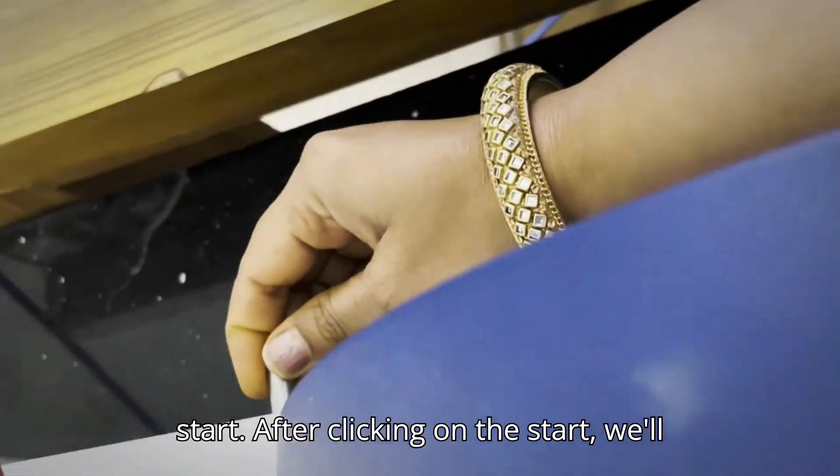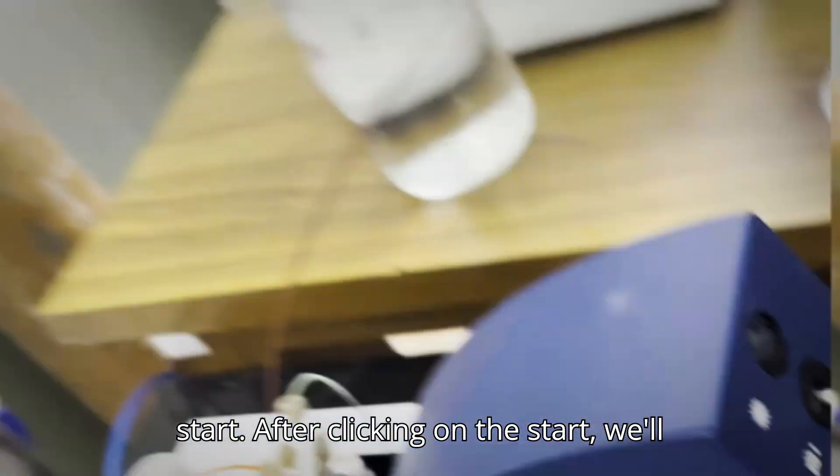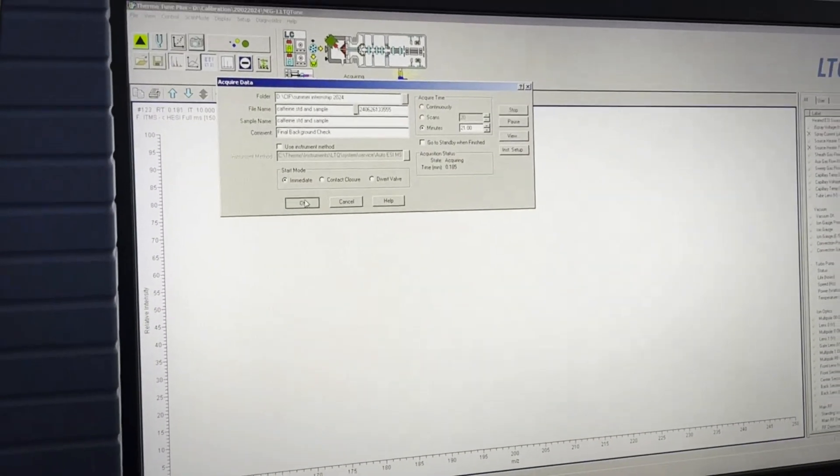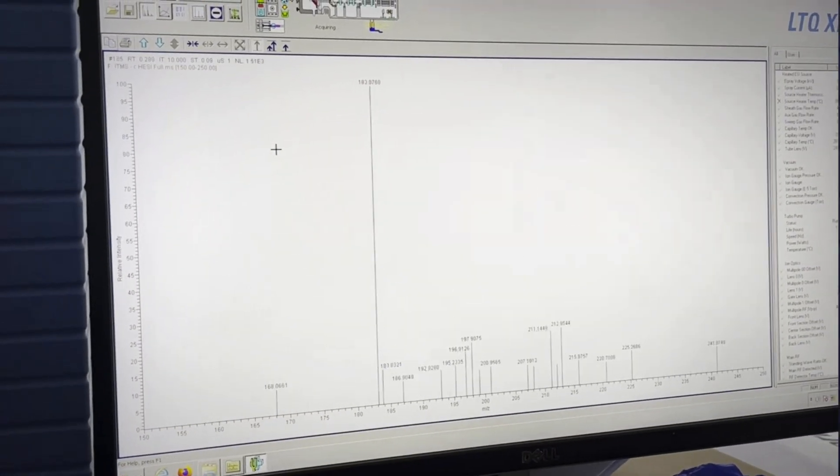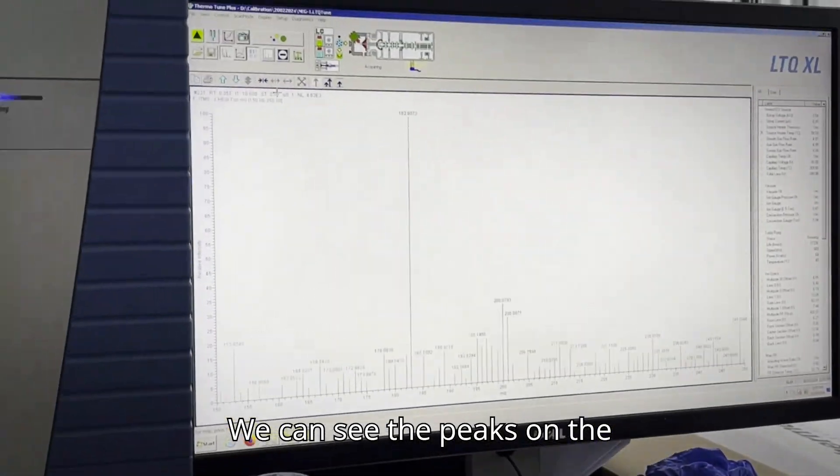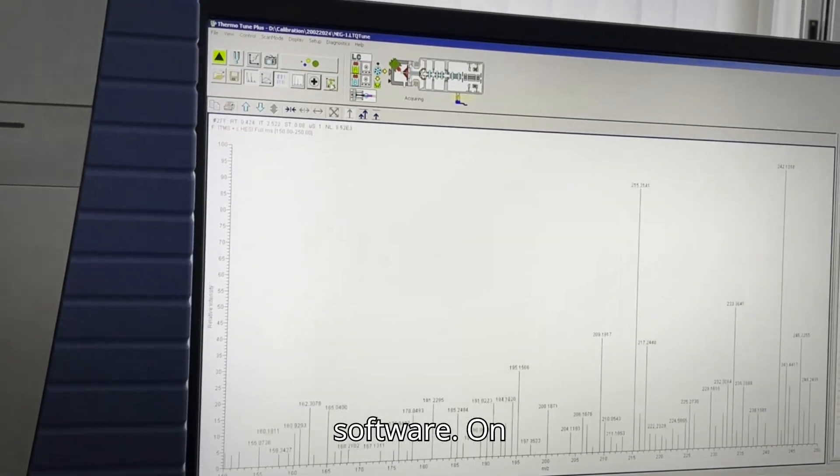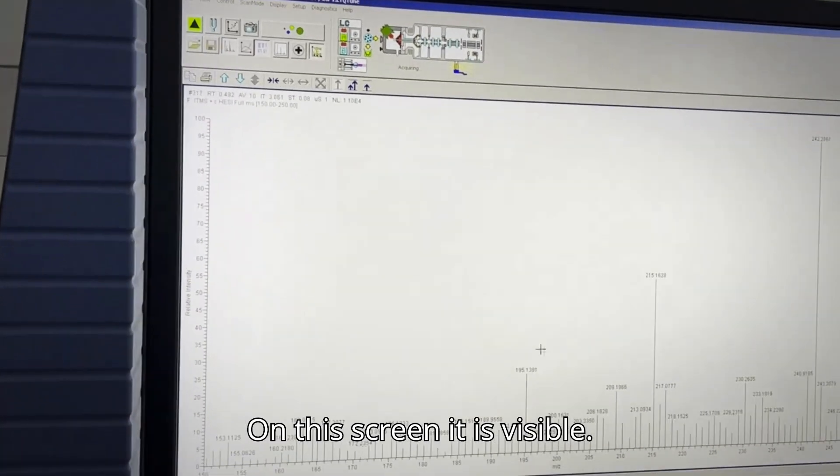Here we can click on the start. After clicking on the start, we will pull the lever. Here we can see the peaks on the software. On the screen, it is visible.